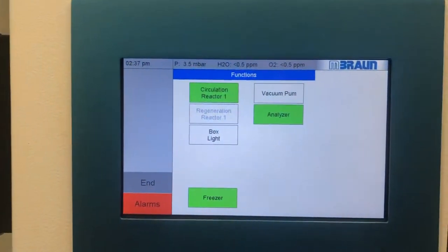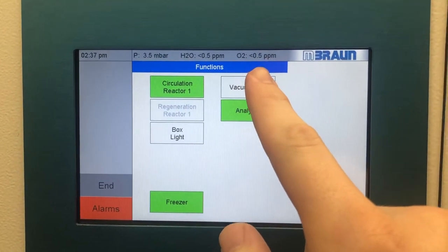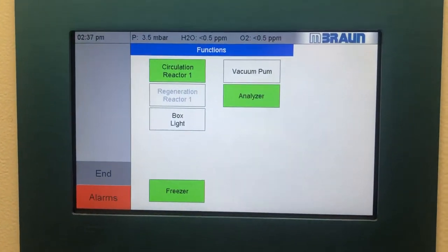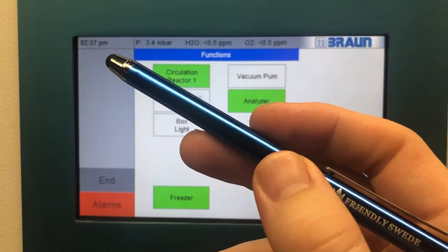Your first thing to do is to check your pressure, the water, and the oxygen sensor levels, and you're going to write these down in the logbook. You're also going to write down the time of which you have come in and the date.